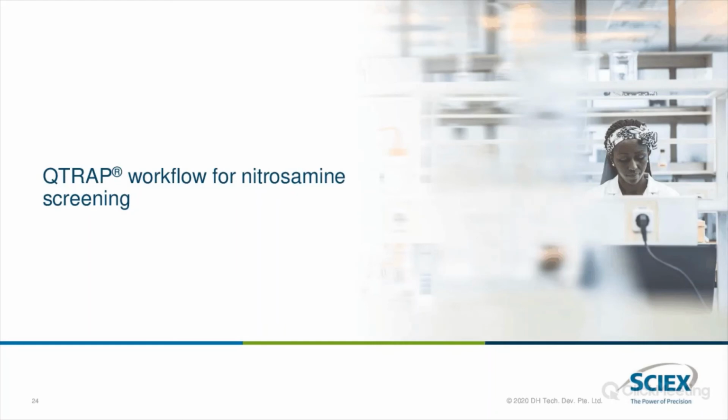The precision and accuracy batches are all within the criteria defined by the regulators. On the Q-trap workflow, I just wanted to take a couple of minutes to explain what the Q-trap is. As I told you already, the Q-trap is not like a triple quadrupole. It's a hybrid mass spectrometer where a quadrupole and a trap, which is basically 2 mass analyzers, sit in a single mass spectrometer. So you can use both mass analyzers as and when required in your laboratory to perform qualitative and quantitative applications. We have run some screening experiments to understand how we can quickly screen nitrosamines in various batches using a Q-trap.